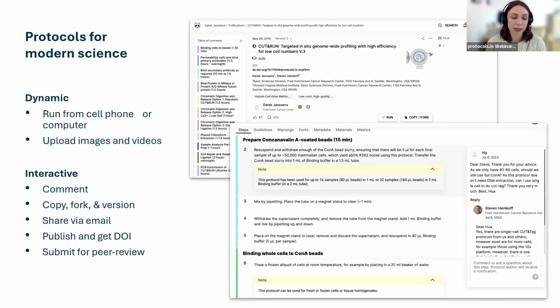Supplementary information isn't text mined. So if people aren't finding the paper, they're not going to find the method in the supplementary information. On protocols.io, the methods can be independently discoverable, and they can maybe even lead back to the paper, but they are independently discoverable themselves.